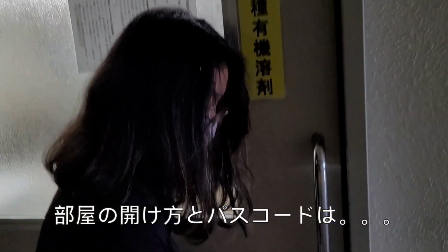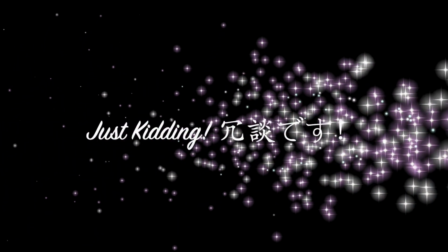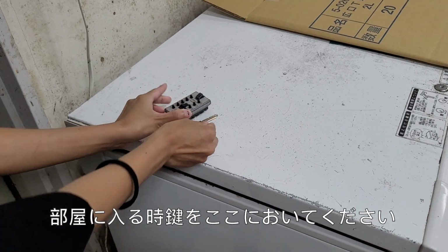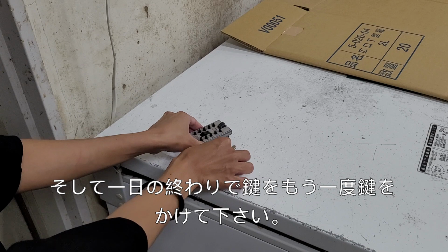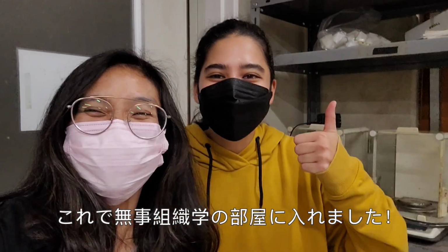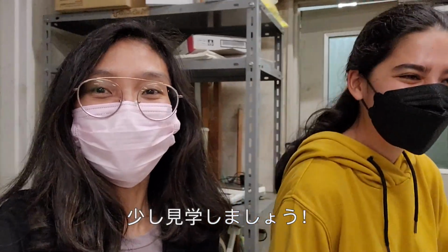So to unlock this room, you go here. Once you first come into the room, you put the key and lock there. And when you're done at the end of the day, make sure to take it and lock it up again so that other people can't come in. So now we're in the histology room. Let's take a look around.